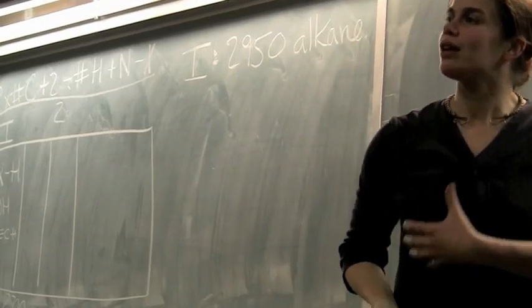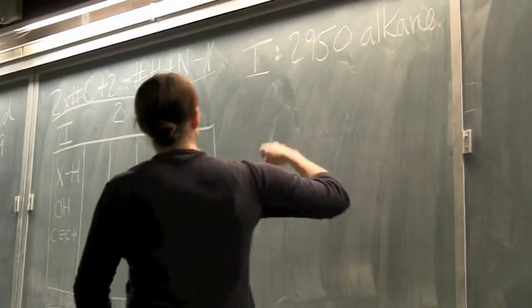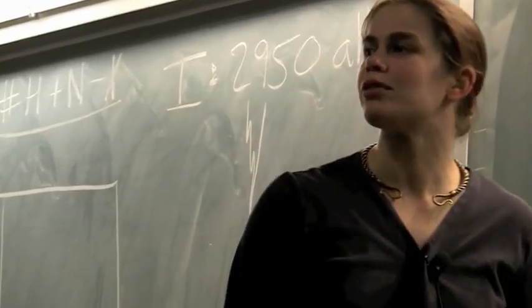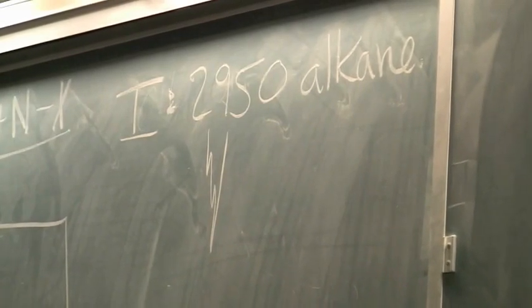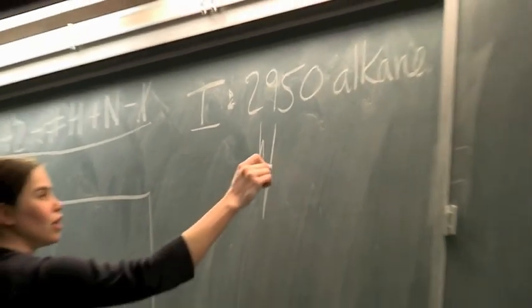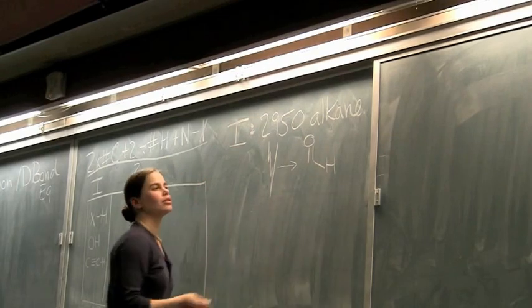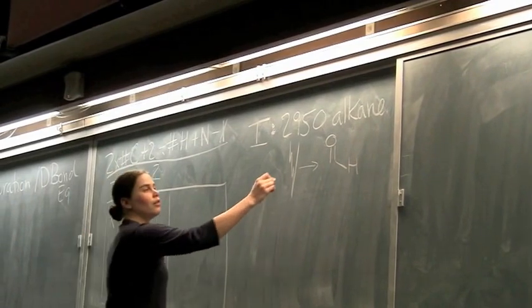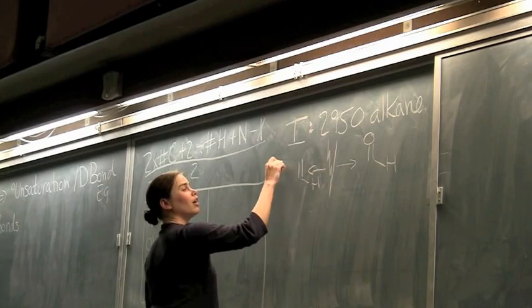So if you're looking for that reference point, you're looking for that big blurry, jaggedy shaped peak that says this is my regular old alkane stuff. There's usually a little bit of a blur to it, a couple of signals there, because there's a lot of different CHs. But what that can provide you with is a reference point. If it's on the right side, lower than that number-wise, you're looking at an aldehyde, a particular type of bond. If it's on the other side, you're looking at an alkene, or even an alkyne, even further down.